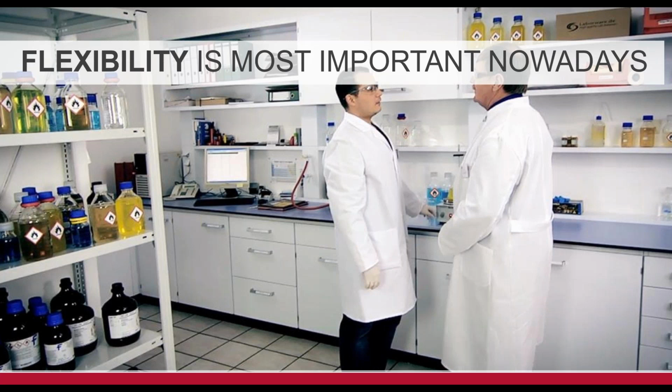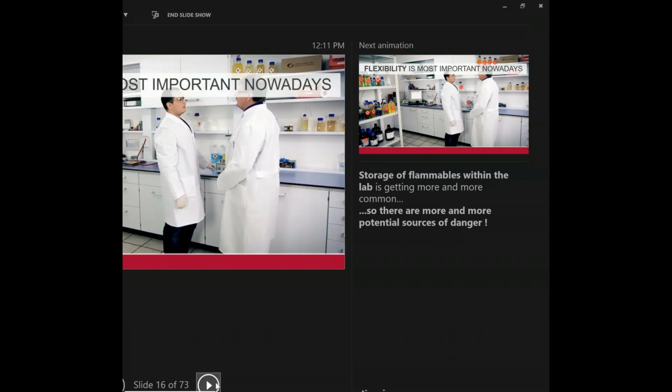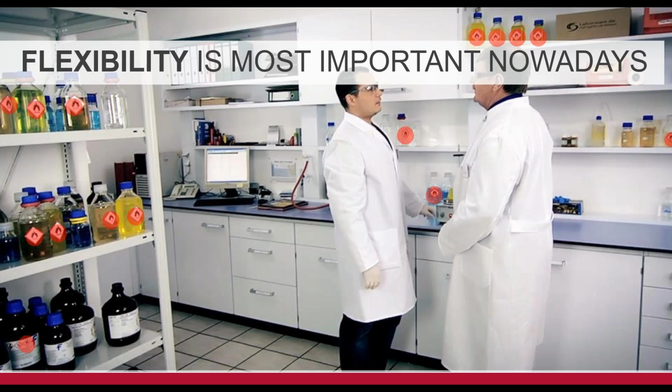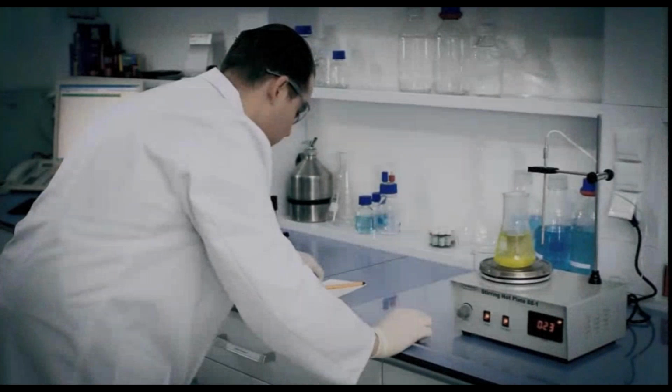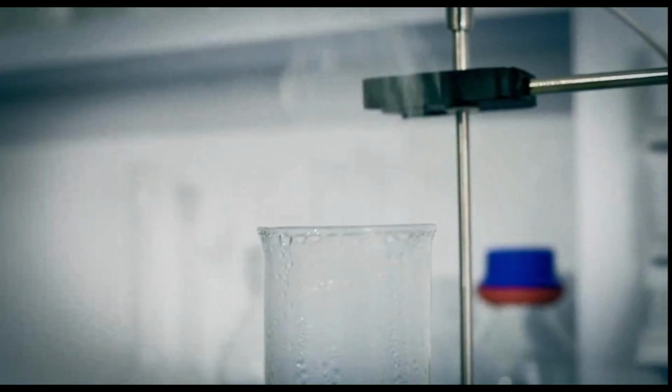Or a third solution is potentially you could provide me a safety cabinet here within the space. That conversation goes on. They leave it at get your work done and let's not talk about it. Of course, he's going to leave a lot of stuff in the space, and potentially here's the hazard that could happen.